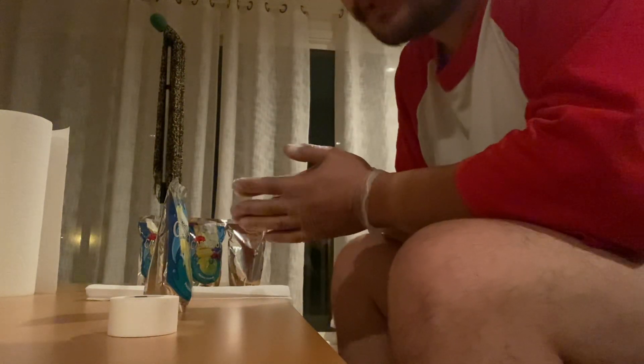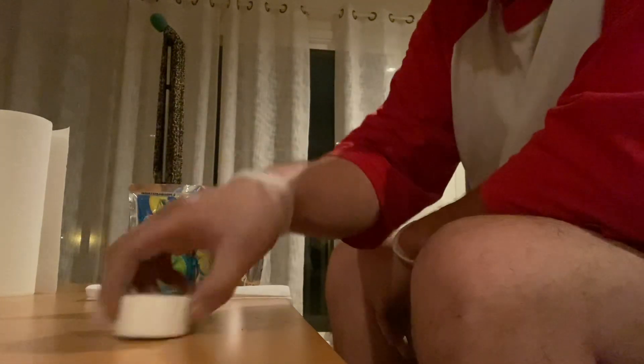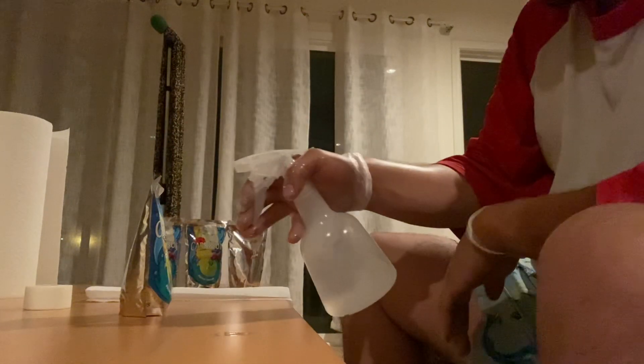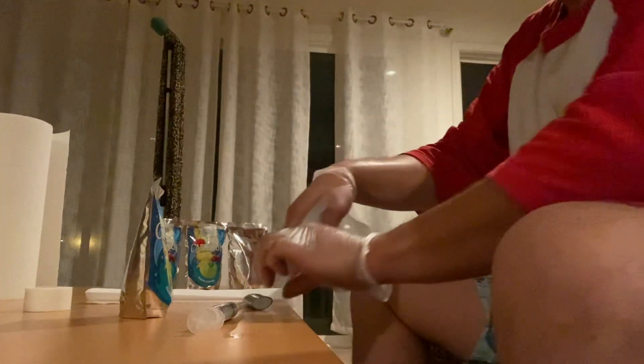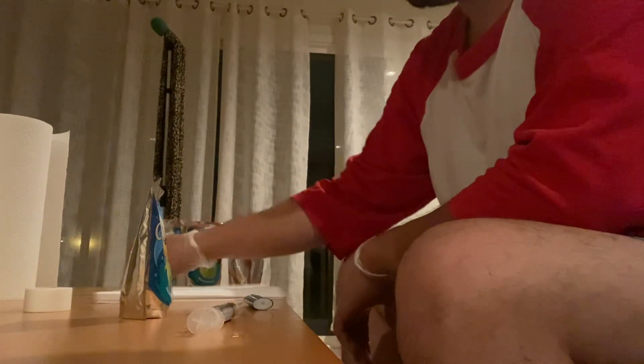We're gonna try something different — we're gonna try to inoculate and make liquid culture out of Capri Sun. We're gonna use Pacific Cooler Capri Sun. We're gonna have our 70% isopropyl alcohol, spray it on our hands, everything nice and clean, spray our bag, get our syringe, spray on our syringe, get our lighter, spray our lighter. Now let's wipe everything down.